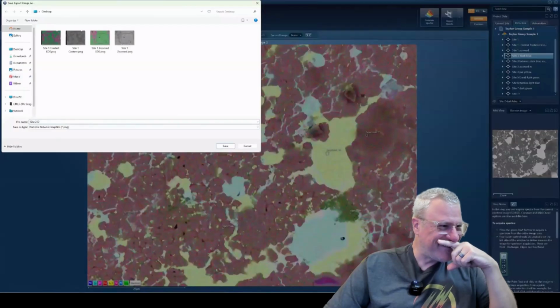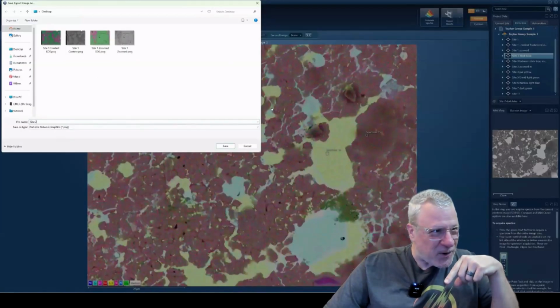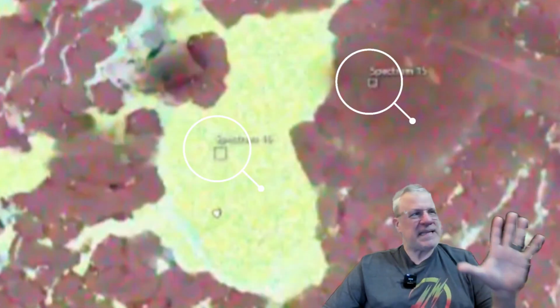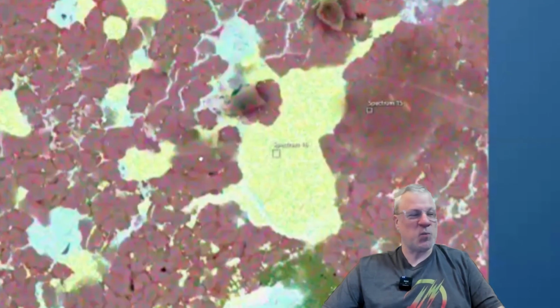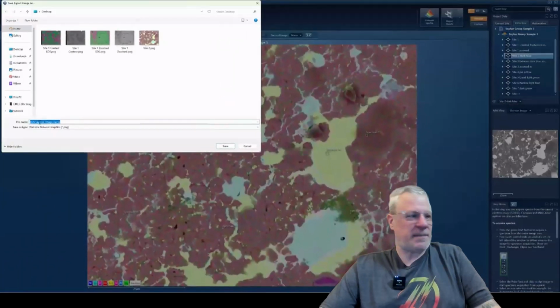Sorry. If you look at how small these sample sizes are, it's right there and right there. This is the one, no, yeah. So this is a small spot on the thin section to begin with, and then you zoom in, and that's the sample size. So it's really tiny. Did you have something to narrate, or we'll pass it to Pat?